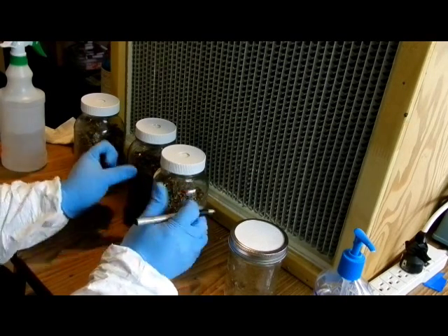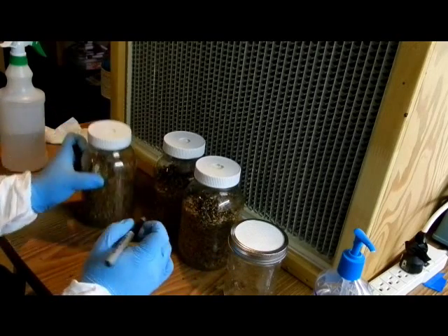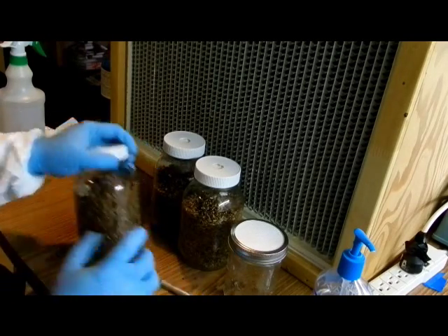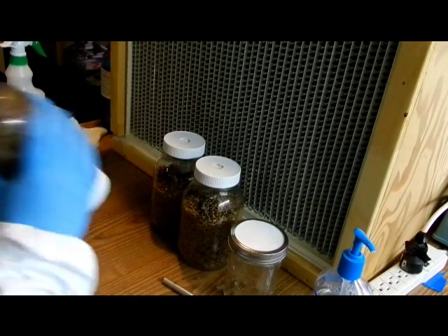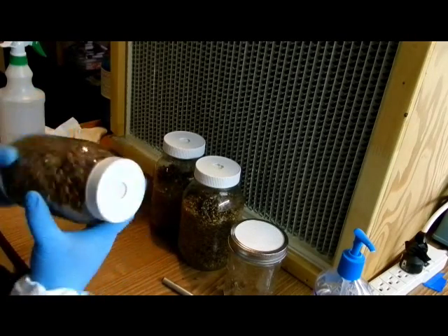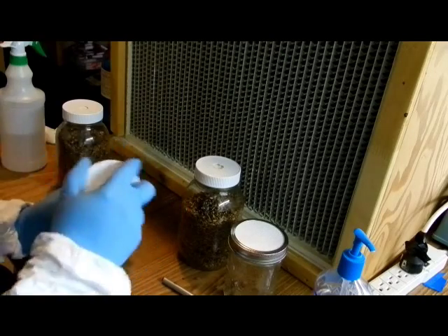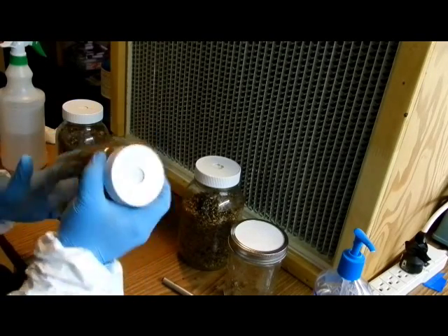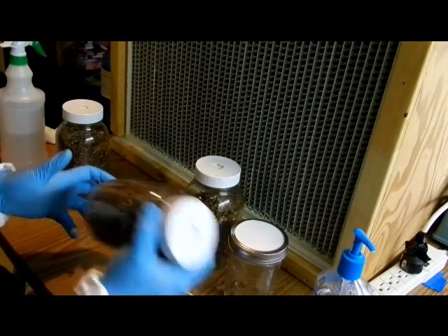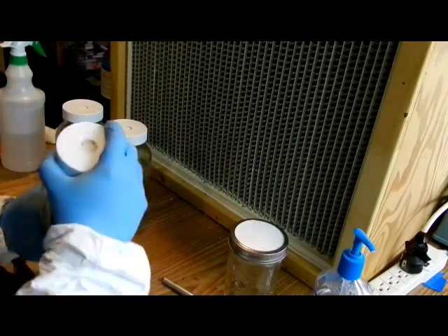Next, you're going to want to label your jars. It's very easy to lose track of what you have going. If you do a lot of grain-to-grain transfers or have a lot of spawn going at any time, it's a good idea to label it with the strain, type of mushroom, and the date. Next, we're going to give it a good shake to disperse all those colonized kernels into our uncolonized grain spawn. That way, when it starts to recover, it will grow out nice and quick. I just move it up and down, twirl it — I'm just trying to disperse the kernels as much as possible. Many people have different techniques; take a couple of tries to figure out what works best for you.